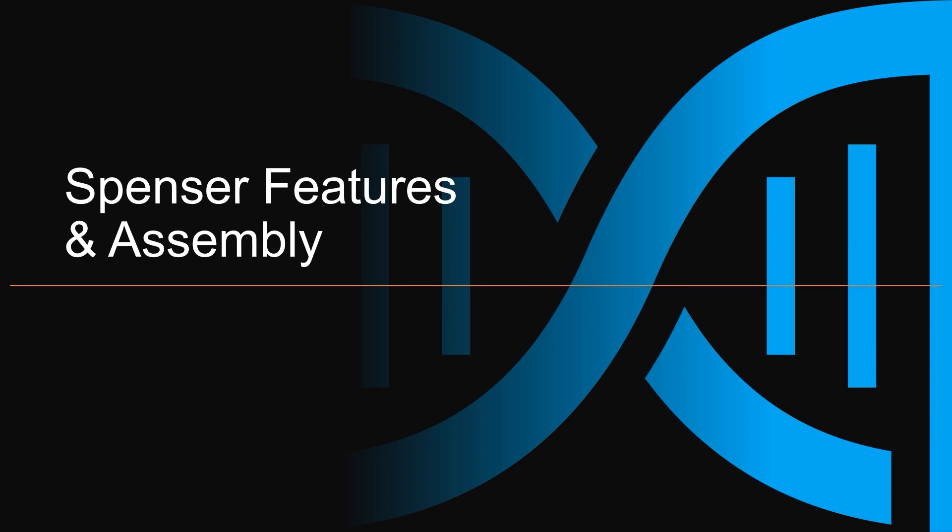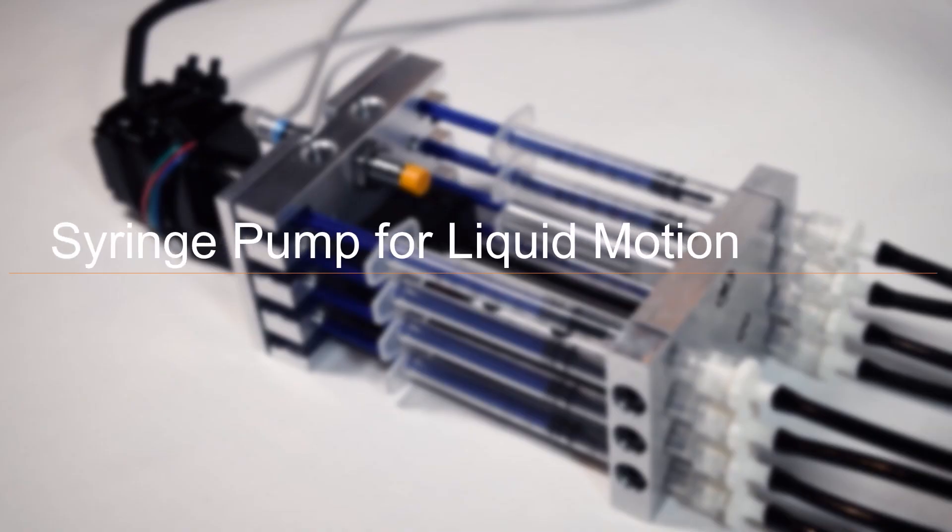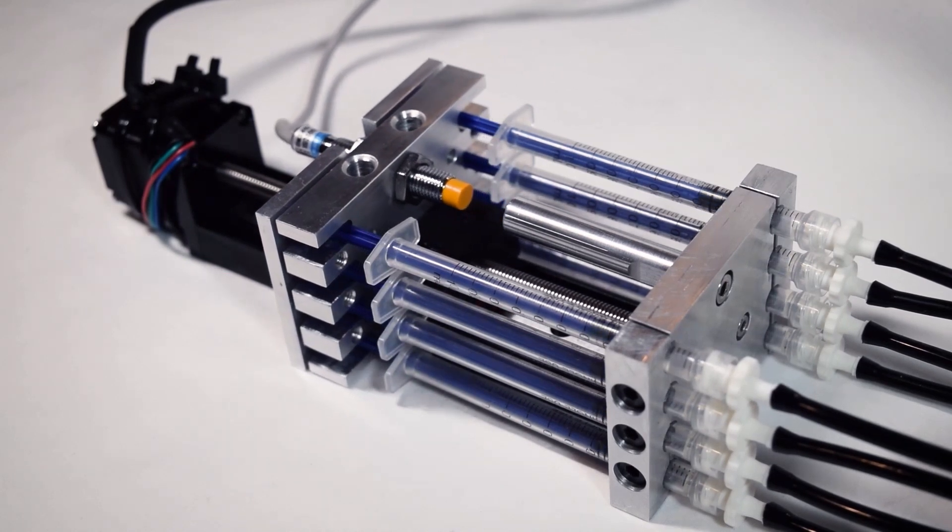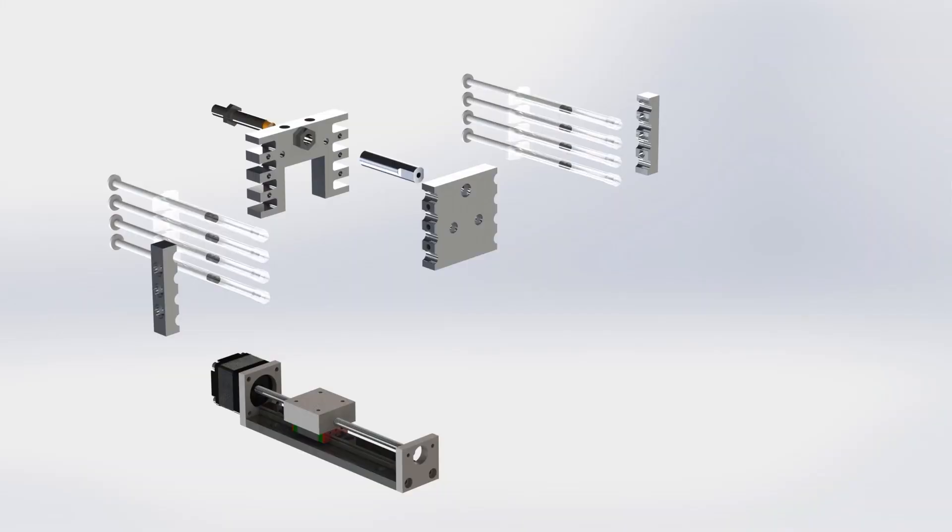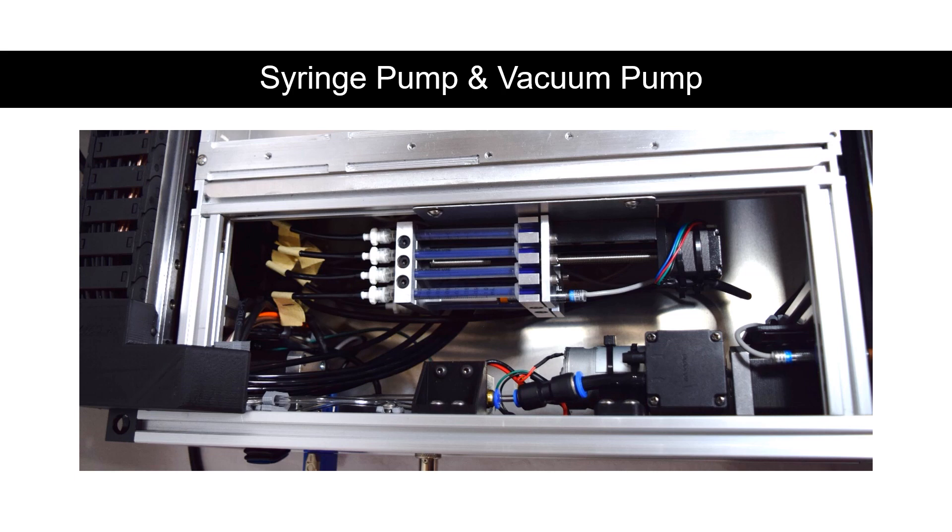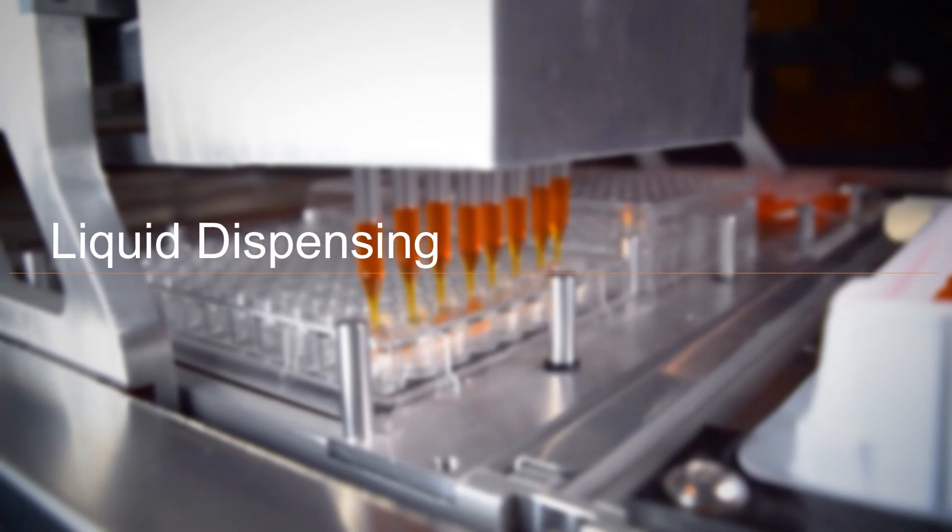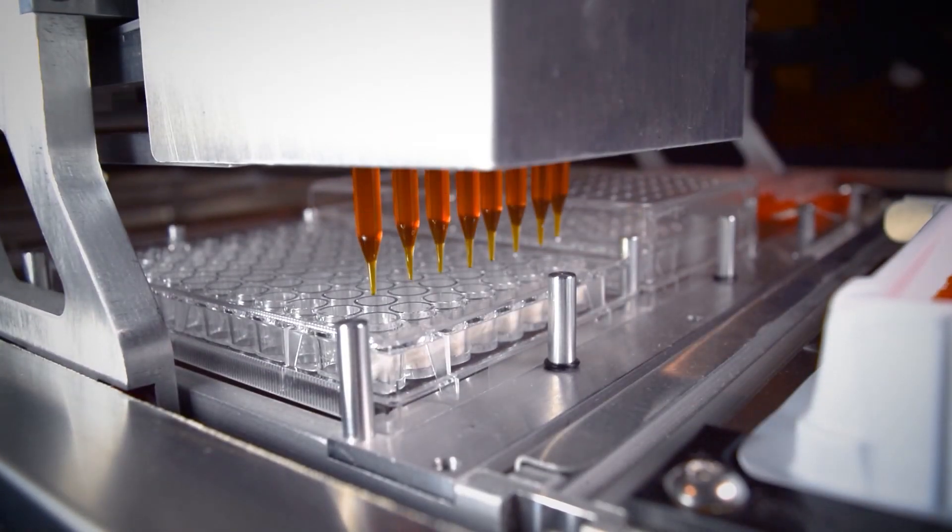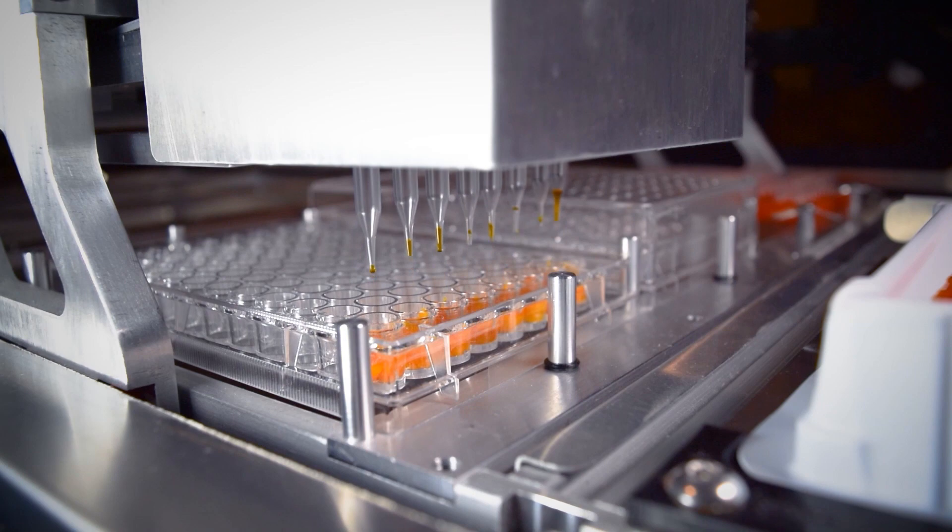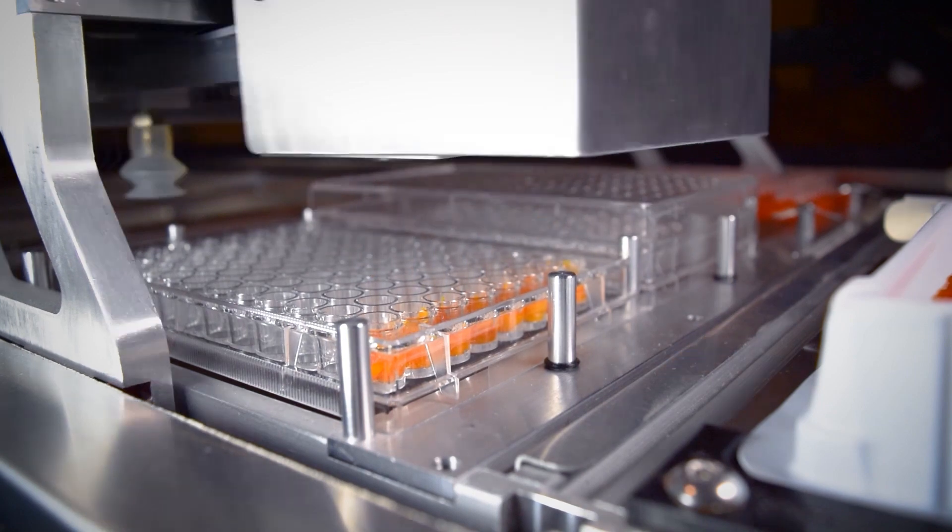The machine has a wide variety of features which we will now showcase. One of the key features of this device is the syringe pump which moves the liquid in and out of the pipette tips. The syringe pump has 8 separate syringes which mount to a linear actuator. It lies in the base of the machine and connects to the head via flexible tubing which is filled with water to avoid issues with the compressibility of air. On the other end of the syringe pump are a set of nozzles which accept disposable P200 pipettes. Liquid is pulled into the tips from a reservoir and then dispensed into well plates as needed.